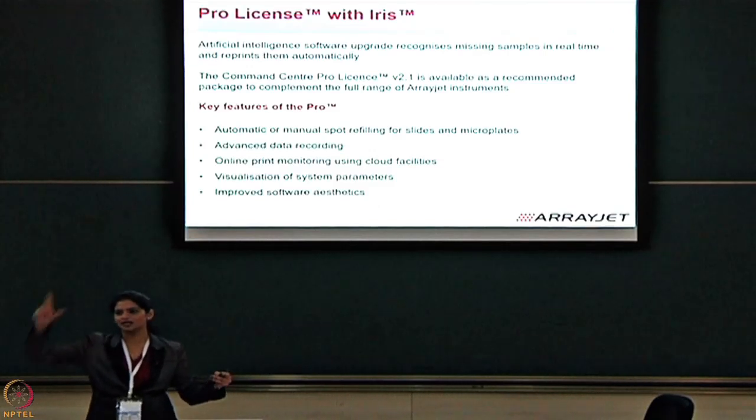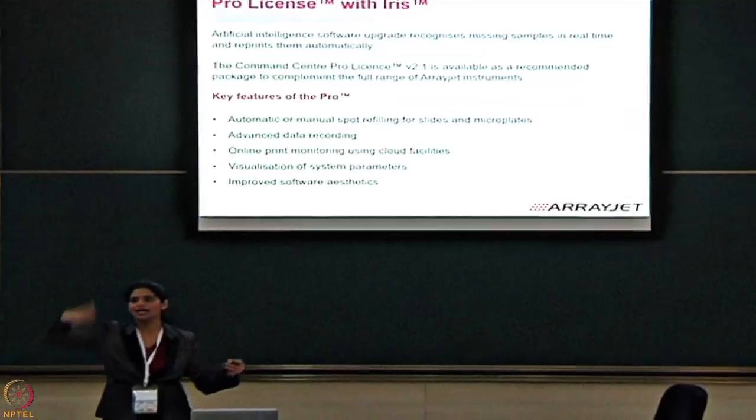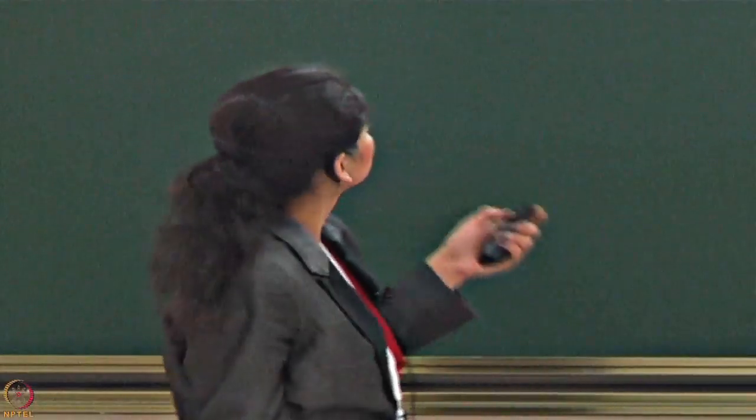Right, this is my assay, this is how successful it was, how many missing features there were, whether it was able to detect all my antibodies, and what my data is. It'll give you a couple of reports, so you just take those reports and then you can post-process them automatically with your secondary antibody or whichever method you are using to characterize, such as RPPA.